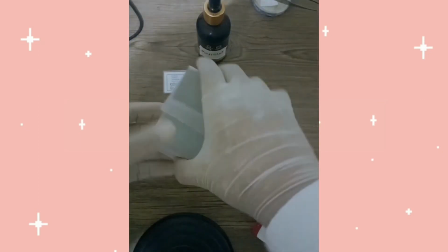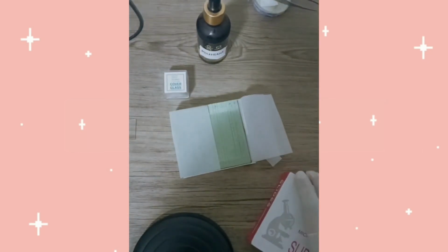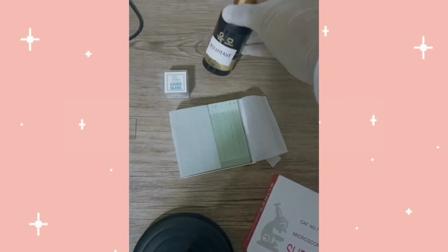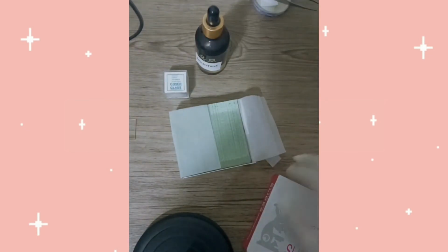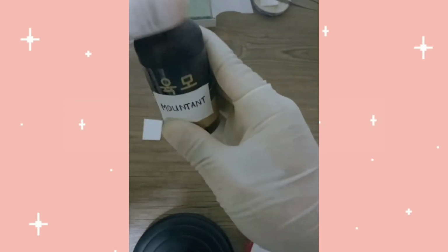We'll be performing the mounting of the tissues. First, we need these kinds of materials. We need the glass slides, the cover glass, the mountant, and our other materials. So to start, we have here our mountant. Let's take a few drops.